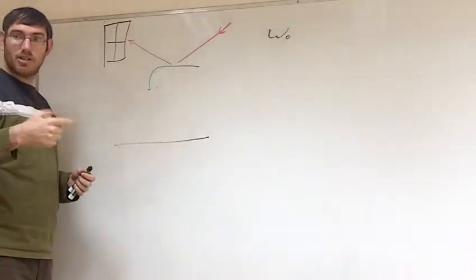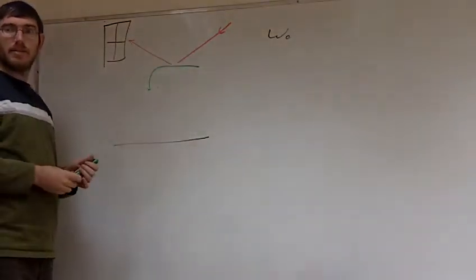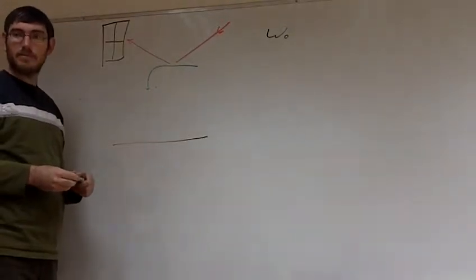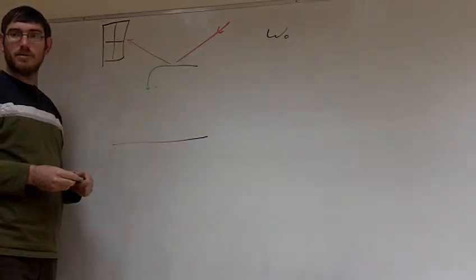And this vibration, you know what a PZT is? Piezo. A piezo, yeah. The vibration is there because it is connected to the piezo. So you are supplying AC to the piezo. The piezo is oscillating, so the cantilever is oscillating. Exactly. Now detection, is there another piezo which is detecting the oscillation, or is it the same piezo output?